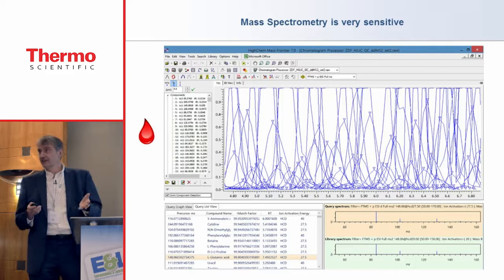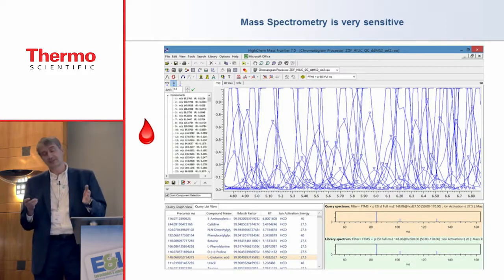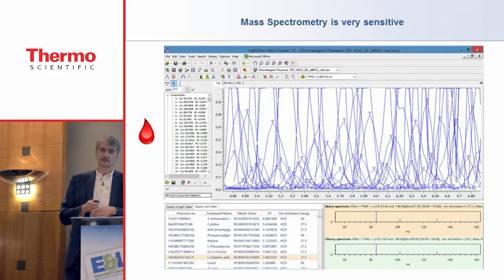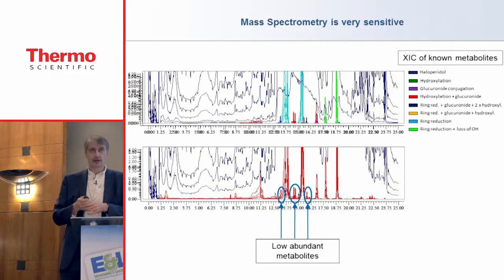Well, today we can identify maybe 10, maybe 15% of them. Some people claim 20%, I would be rather skeptical. But still, this is a very small portion of all compounds we can detect in complex samples. If we reduce the structural space, let's say, look only at some pharmaceuticals in human plasma, this is one metabolite experiment.